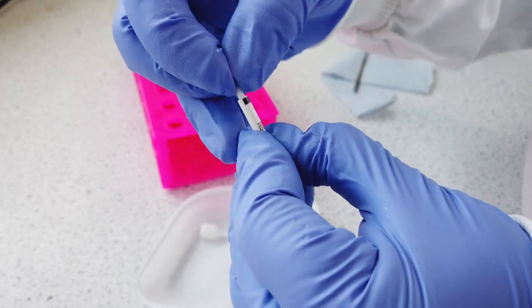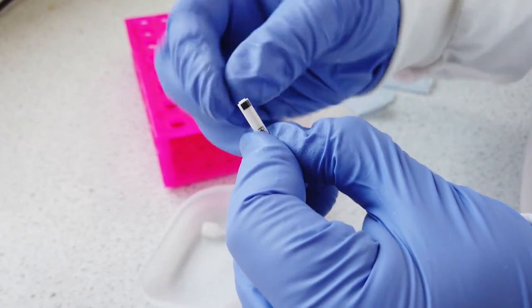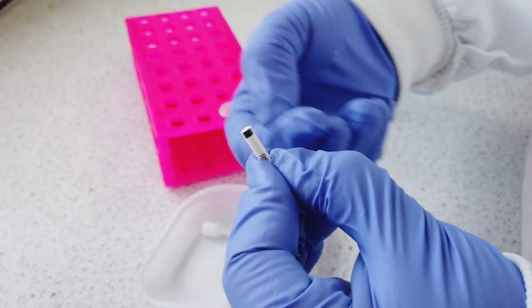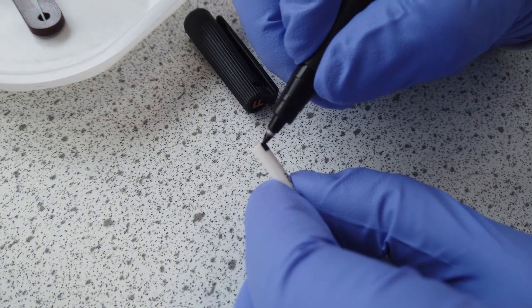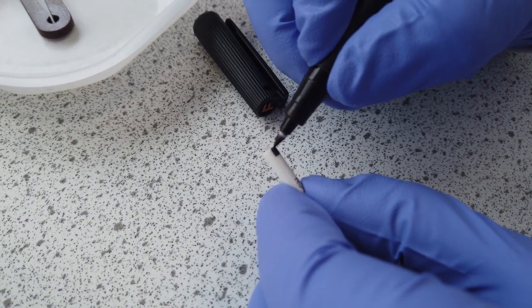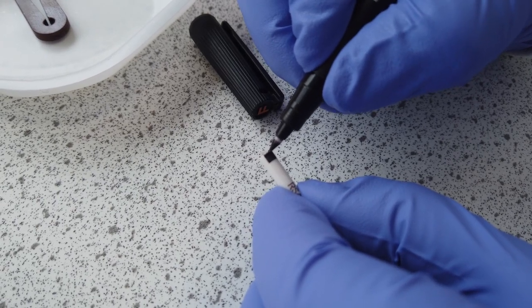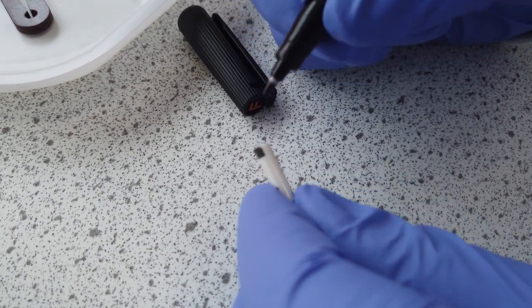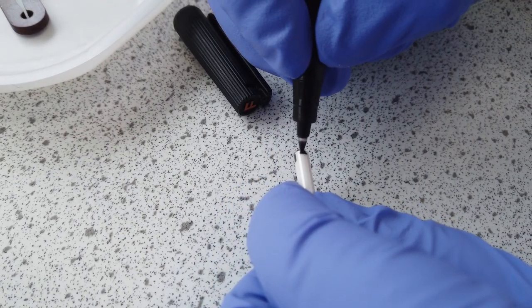After loading your sample, place the top cap into the sleeve and push it down until it is in line with the sleeve. Before you insert the rotor into the NMR spectrometer, draw a black line covering approximately half of the rim using a black permanent marker. This will act as a laser mark and allow the spectrometer to correctly detect the spinning.